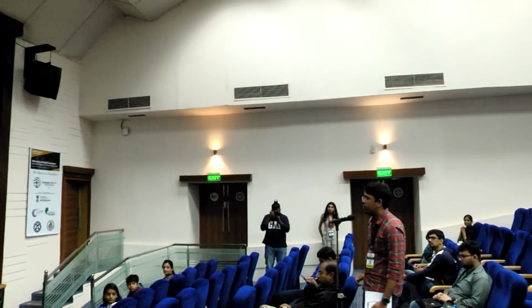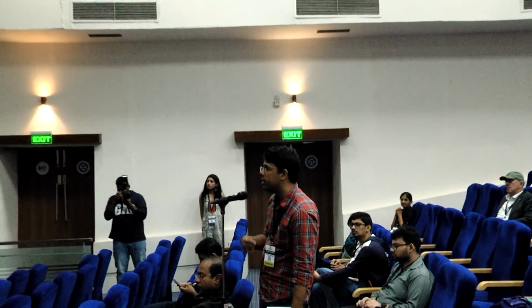Hi, Maria, nice talk. I just had a quick question. In one of your slides, you were showing the degree of elongation in different contexts, I mean the size of the channels, from 5 micron all the way to 100 and non-preferential. I saw that at 5 micron, of course, it was tending towards 1. But as you move across the spectrum from 50 micron to over 100 and non-preferential, it goes back again to 1. It dips in between and then goes back. I was just wondering what the reason is behind that.